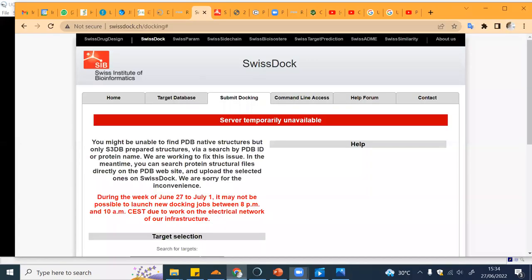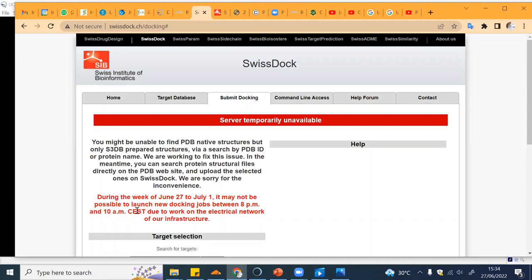Now you can go to swissdock.ch/docking. Currently the server is unavailable but it will be available outside of 8 PM and 10 AM CEST, so you can try that by yourself later.